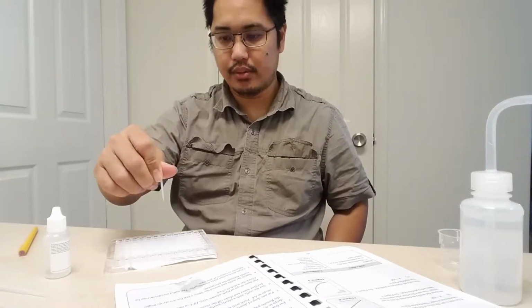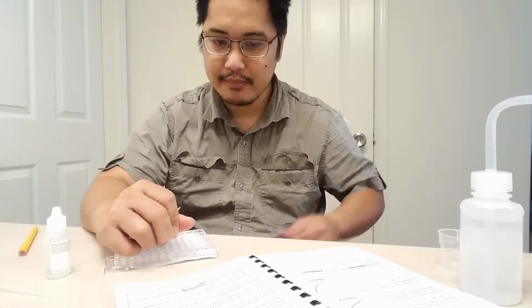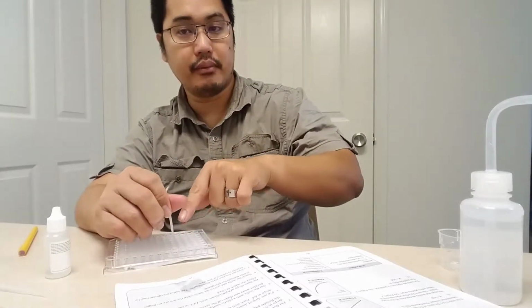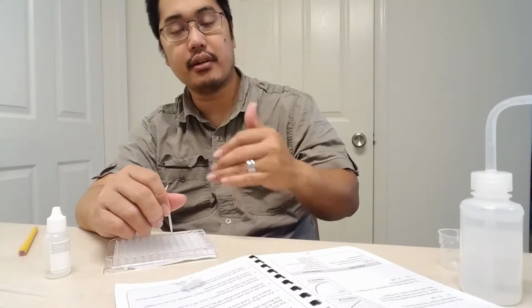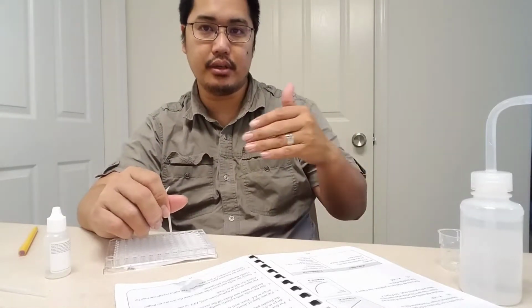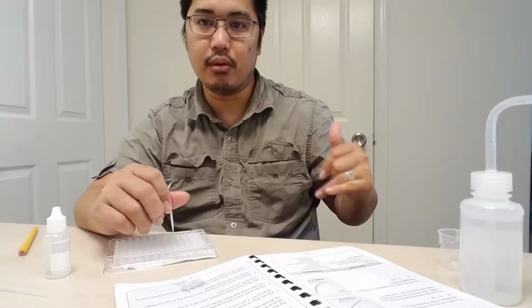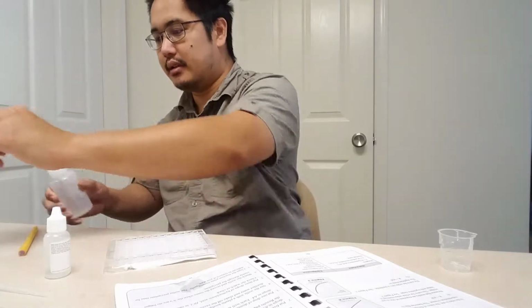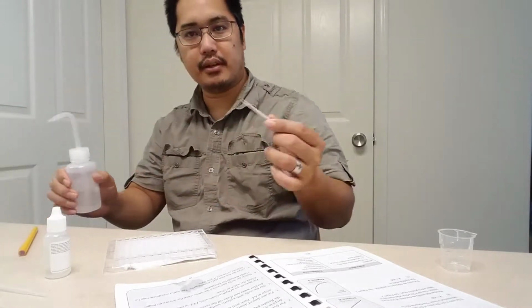All right. Now I'm going to stir this mixture up with a plastic toothpick. But I don't want to go from A5 straight into A4 because there's some sodium thiosulfate on here. I'm starting off with A5 and working my way down to A1 because I'm going from the least concentration to more concentration as we go. To deal with that, I have my handy dandy distilled water. I'm going to spray down the toothpick and shake off the water, so that, to the best of my ability, I've cleaned off the sodium thiosulfate.